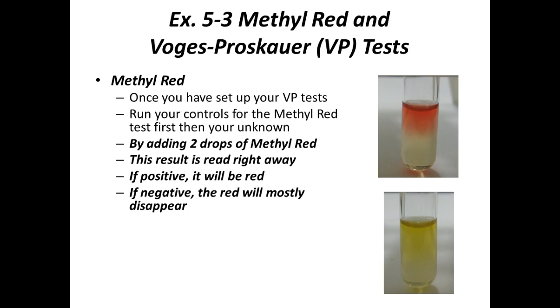So this is our protocol for methyl red test. Again, it's just a quick pH test. You put the reagent in, the pH indicator, and you read your results. This is one of my favorite ones, though, because I feel like a magician, right? Because for the negatives, the red goes away and it turns yellow, and the media is kind of yellowish. So unless you look closely, it almost looks like they disappeared, right?